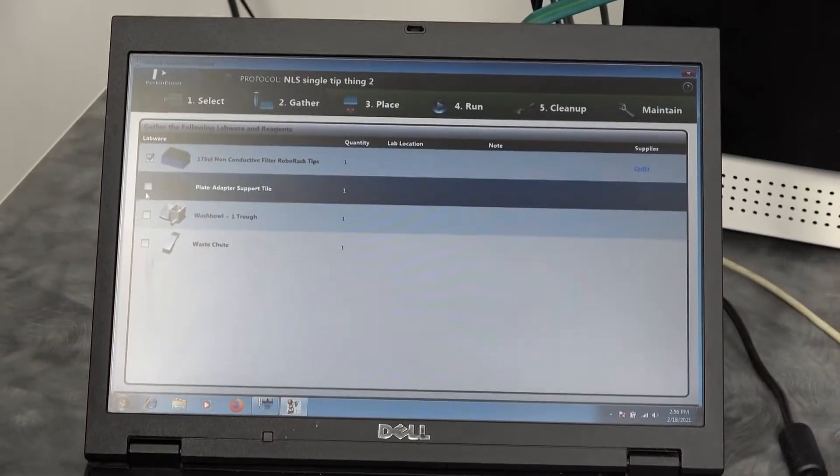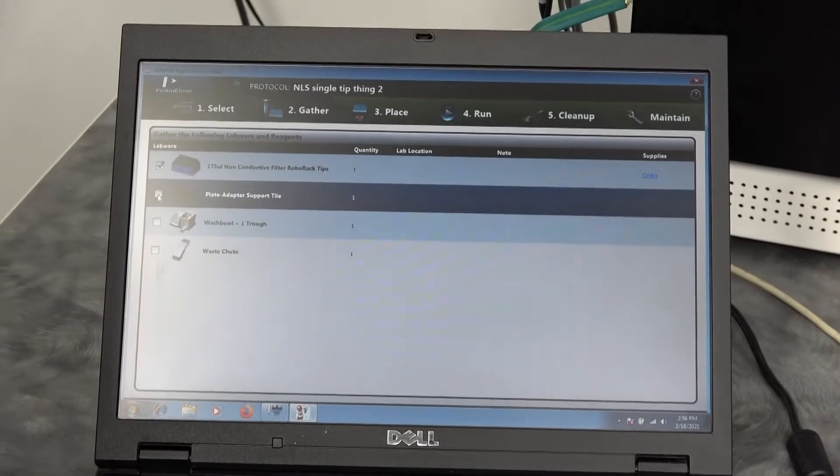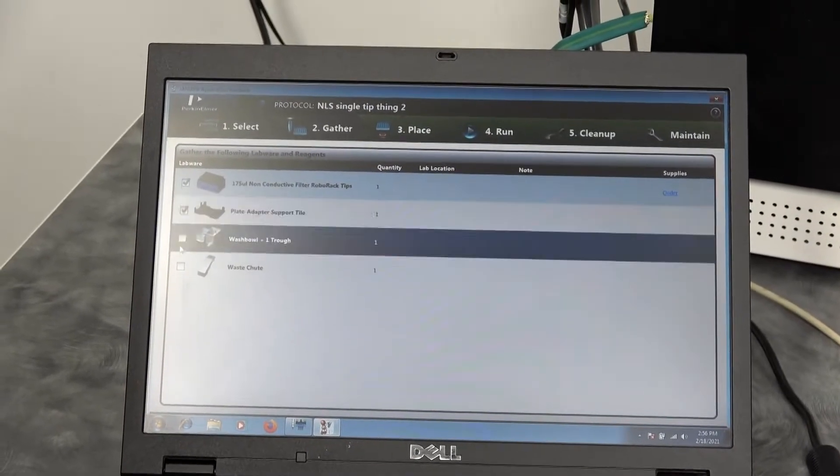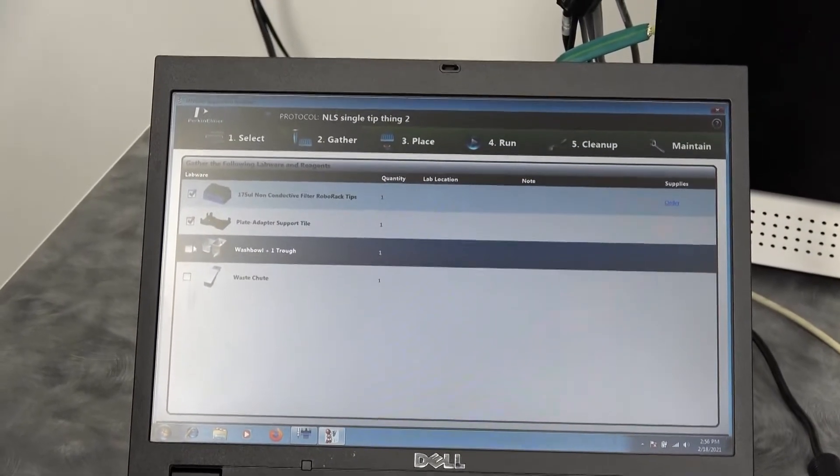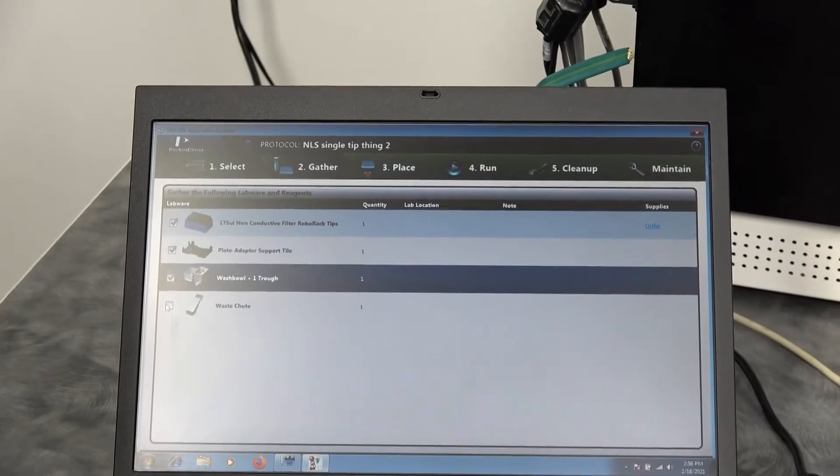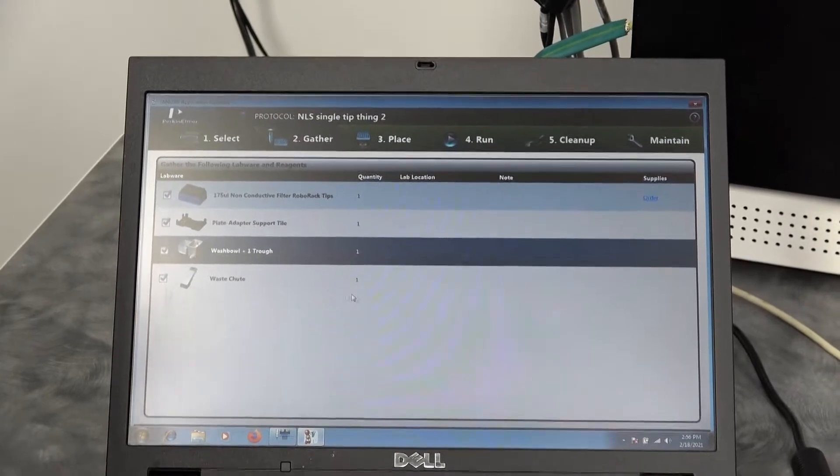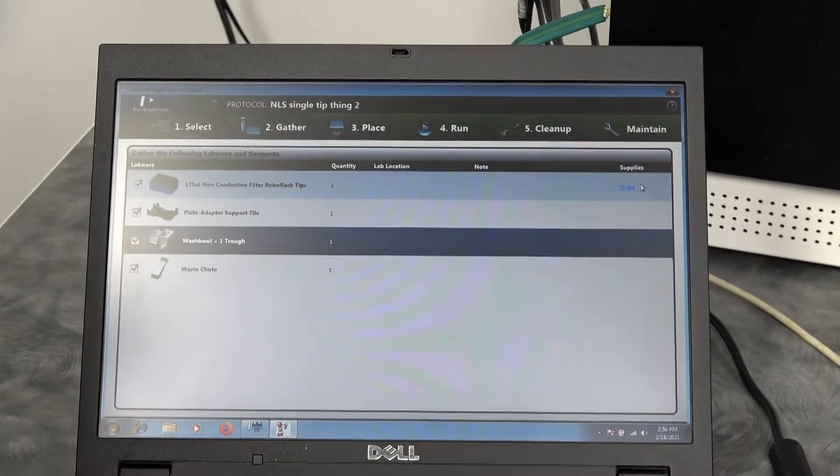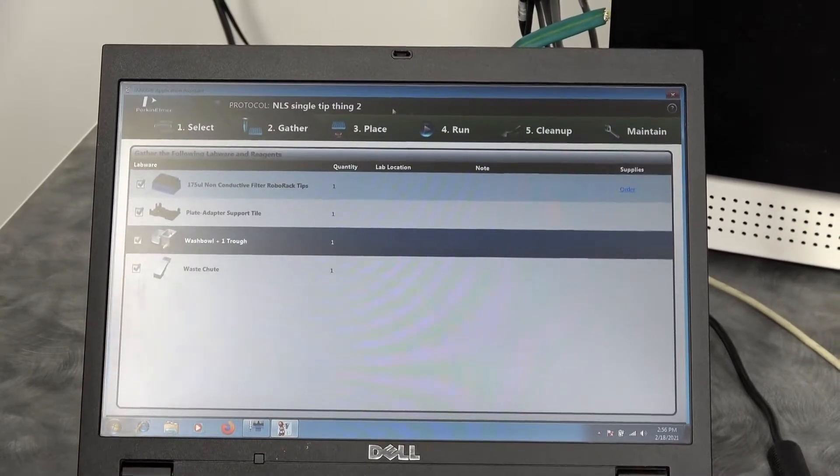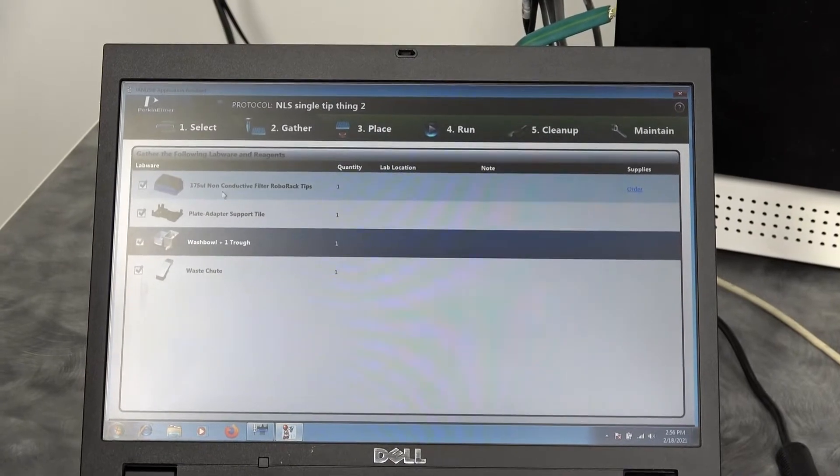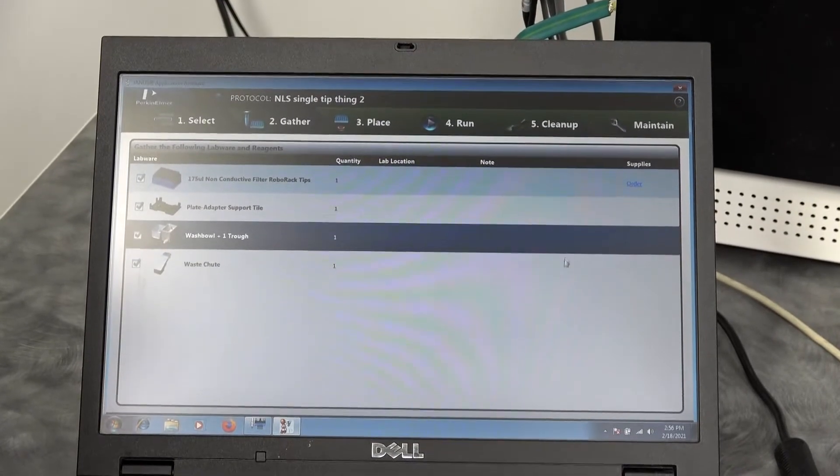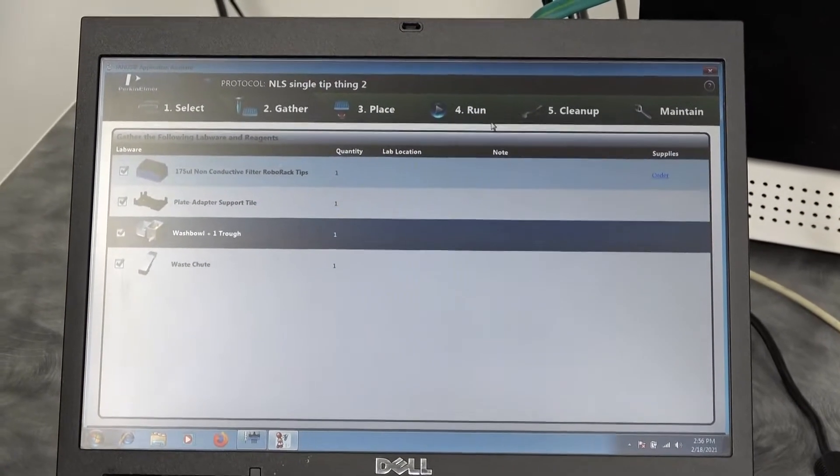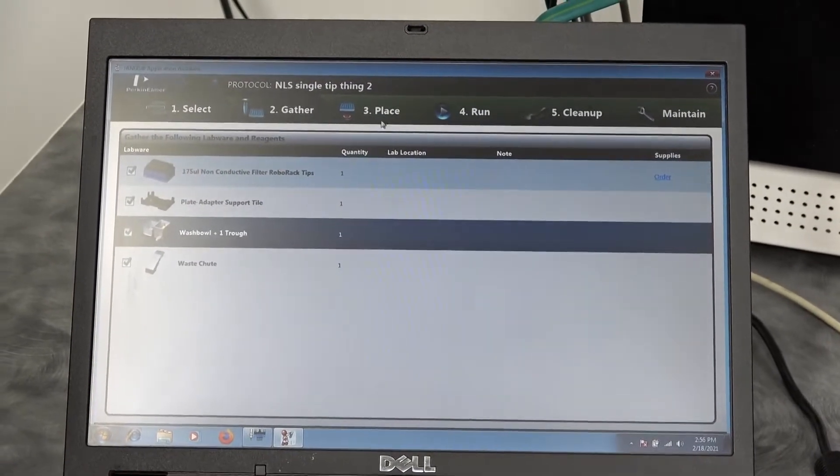It has a checkmark system, although it's more as just a reminder that yes, we've gathered all those up. It also has a link for ordering the product, so if you're out of tips, you can go ahead and order them right from here.